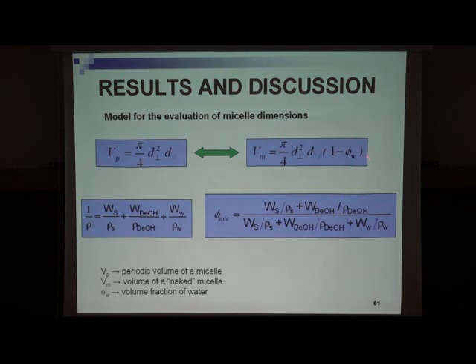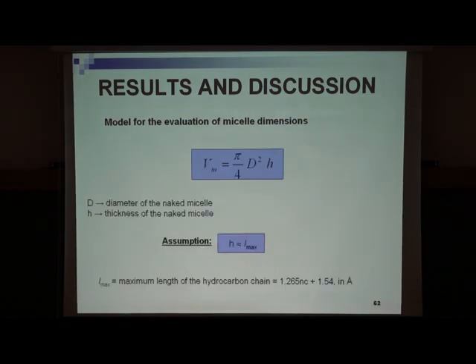If we subtract the volume fraction of water, we can obtain the exact volume of the naked micelle, and this value can be obtained from this equation, and this value from this equation. All these equations are found in the literature.